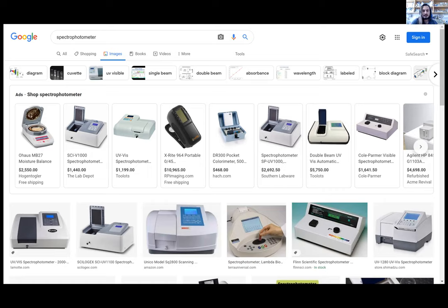And the issue there is that if you're an amateur biologist and you want to do molecular biology, and you want to make competent cells, making E. coli able to absorb, to take up plasmids, you need to catch them at a particular stage in their growth curve, right? As they're growing, when they're super, super healthy and rapidly dividing, and their membranes are not that intact because of the constant division, that's the perfect condition to ingress plasmids. So, but you need to measure that.